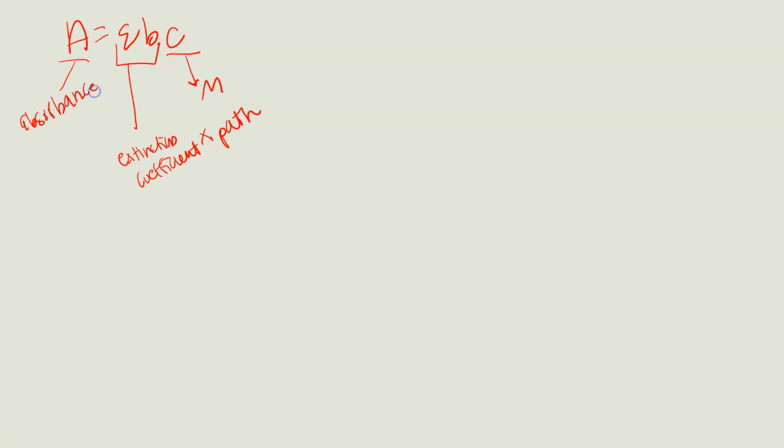Now, what's great about this instrument is that it's more sophisticated. The atomic absorption instrument is more sophisticated than the visible spectrophotometer, and it's operated by a computer. So what's wonderful is as long as you do a good job in part A, where you make your standards, as long as you make solutions whose concentrations are correct, you won't actually have to use the Beer's law calculation for this lab because the computer does that math for you.